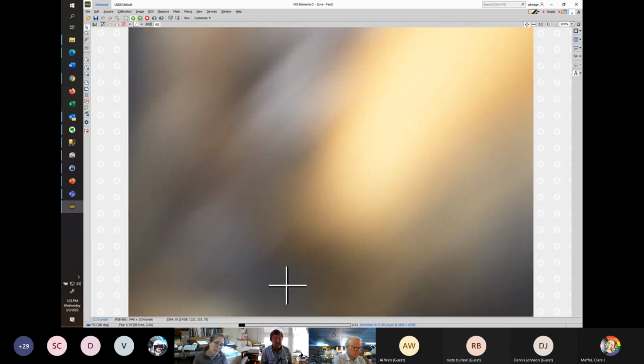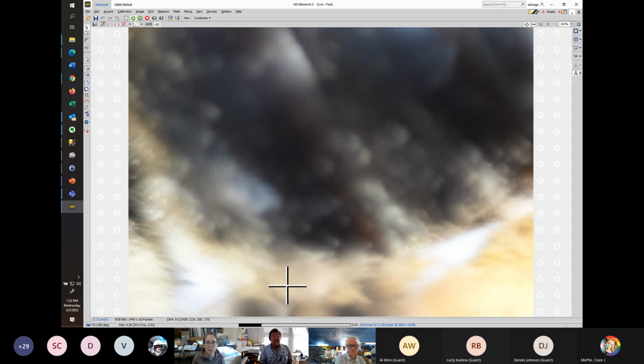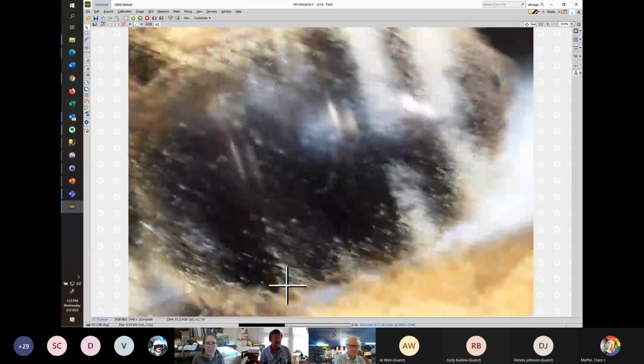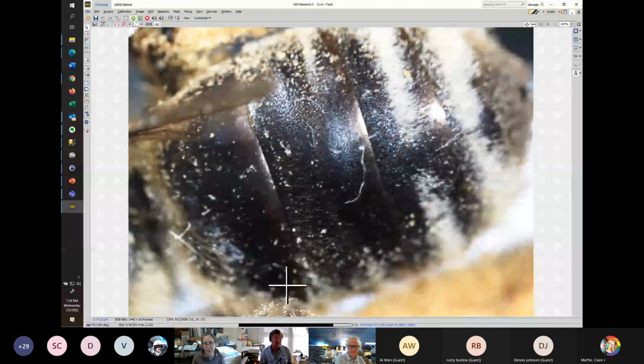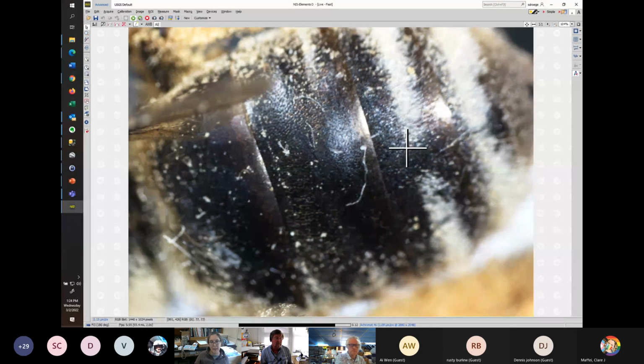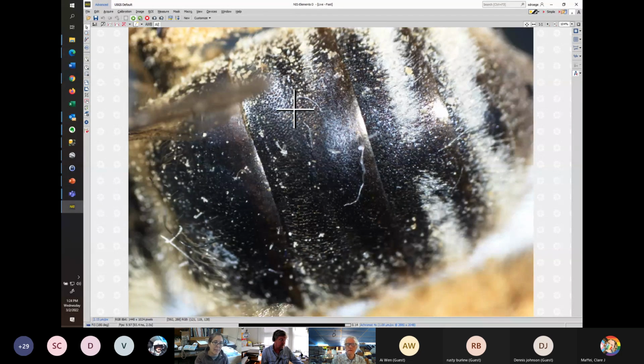Yeah, another thing, up on that next segment, T3 and T2 there, with coloradensis, you have some interesting hairband patterns on the other segments. So T3 is what I would call interrupted, because that hairband is interrupted by much less than 1/3 the width of the segment. And then on T2, you do have those little white areas coming in from the side, I call that lateral. So the separation between the two is much more than 1/3 the width of the segment. So I call that lateral, and then I'd call what is on T4 just interrupted.